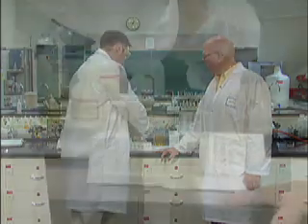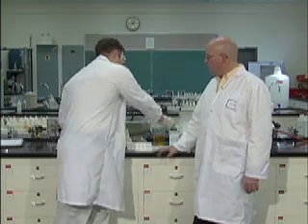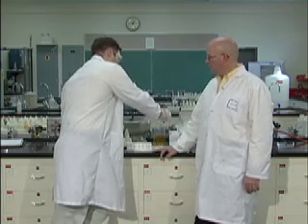Make sure you save your 6, because you only get 6 or 10 Durham tubes to practice with throughout the experiment. So, do we have to throw these away at the end? At the end, yeah, at the very end.